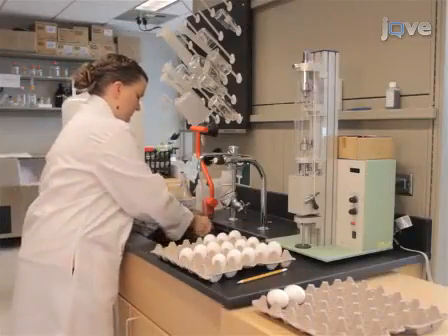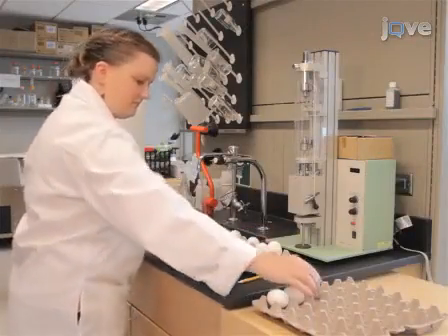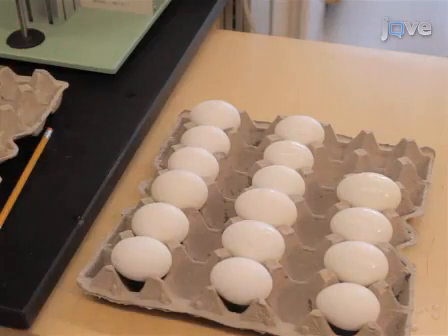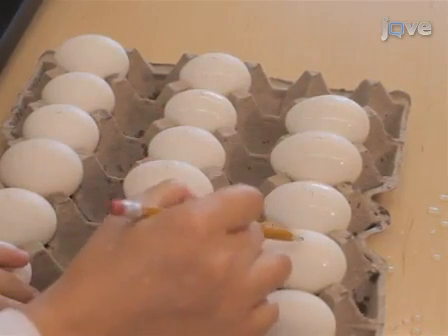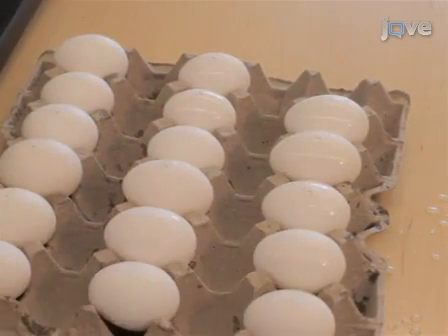Begin by washing any debris from the chick eggs with tepid water. Arrange the eggs horizontally on a tray and then mark the sides facing up with pencil to denote the region where the embryo will be localized.